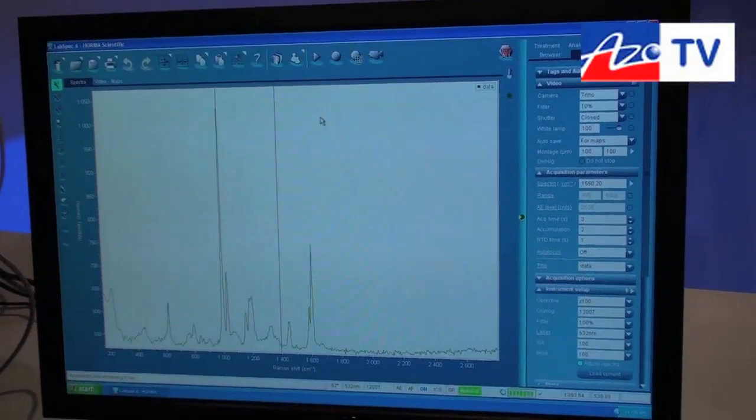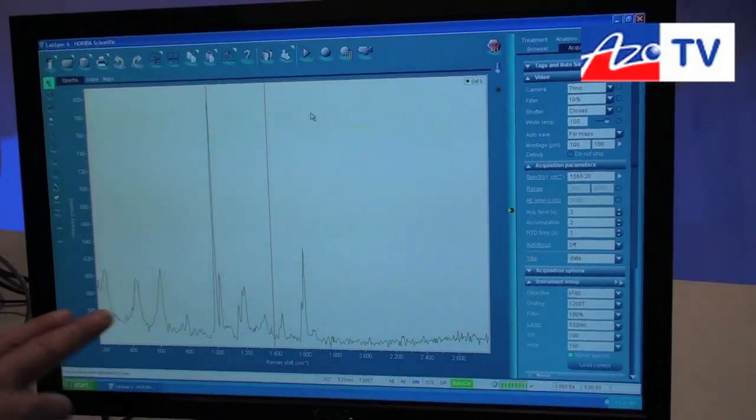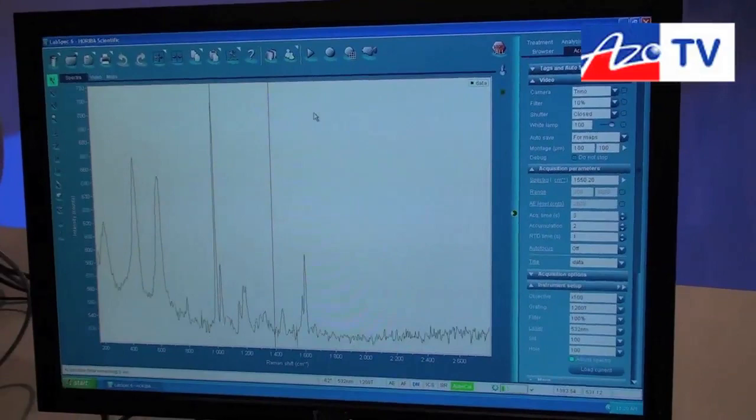This is the Raman spectrum that we see and what's nice about this is that as we go in depth, I'm going to move the stage to make the beam focus inside the sample, then the spectrum is changing and we see these two peaks arising and the features of the polymer decreasing.